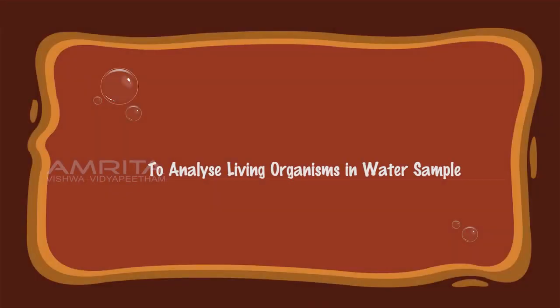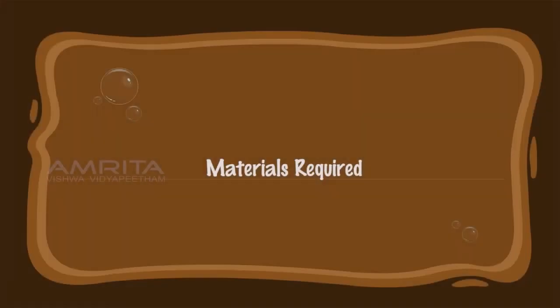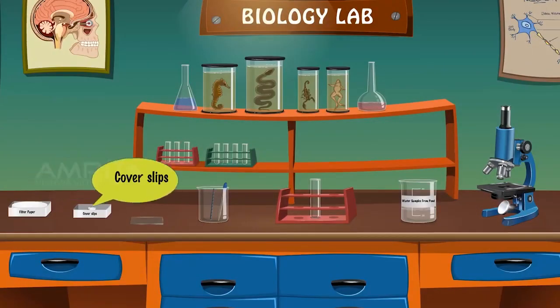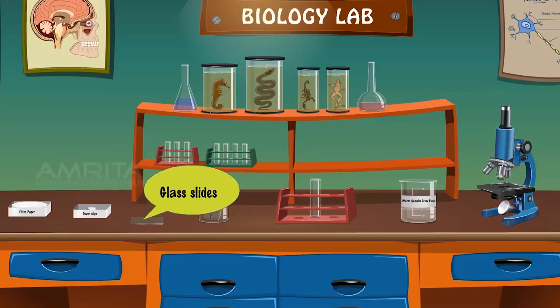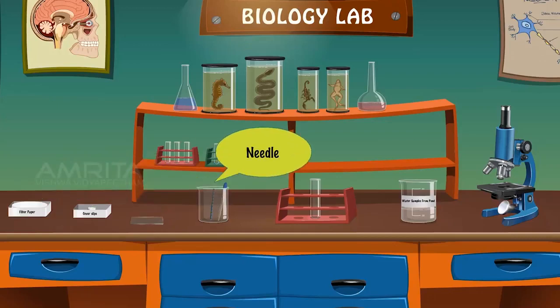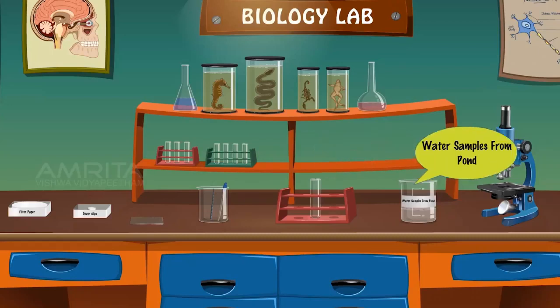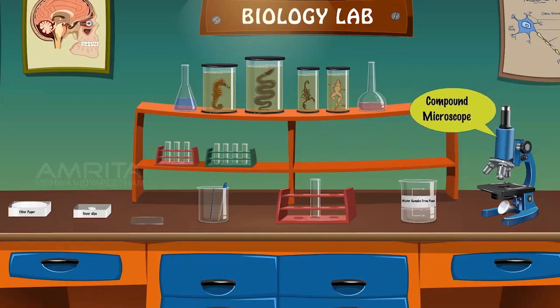To analyze living organisms in a water sample. Materials required: filter paper, cover slip, glass slide, needle, dropper, test tube, water sample from the pond, compound microscope.